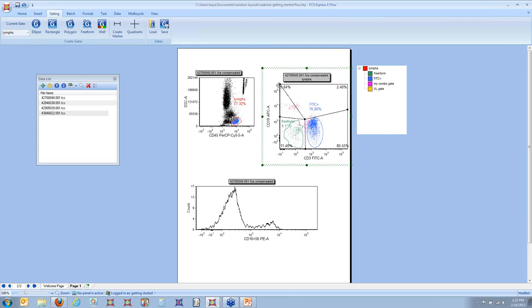Okay, maybe it's hard to see, but if I gate this plot on the upper left quadrant, you can see that as I move my quadrant, the gate is updating. That's a real handy thing to do. And now this upper left gate, which was created based on the quadrant, can be applied to any other plot, just like a normal gate.